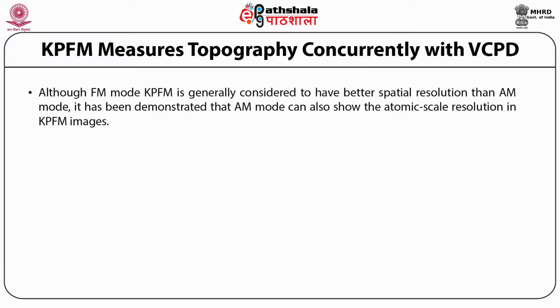Although FM mode KPFM is generally considered to have better spatial resolution than AM mode, it has been demonstrated that AM mode can also show the atomic scale resolution in KPFM images.